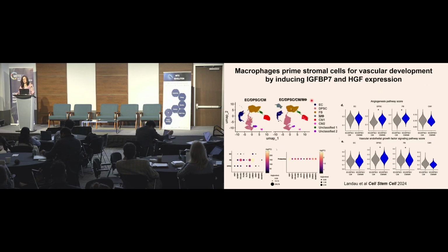So we did 2 things. We basically figured out by single nuclei sequencing what are the cell populations that we have in the 4 cell type tissue. And we also took the culture media, and so we performed proteomics, secretomics, and this was a collaboration with Carolyn Cummins, to figure out what is actually made, what ligands are made and secreted in the culture media. So when you do those 2 things, you can really figure out receptor-ligand interactions because you know what's made.